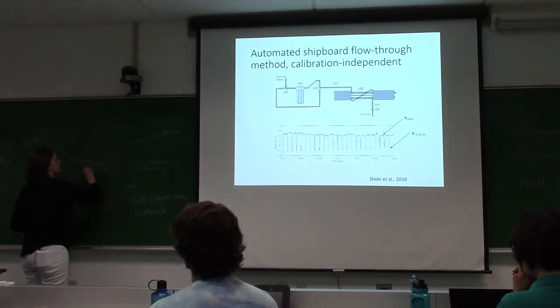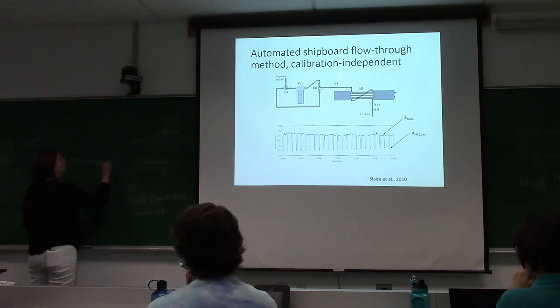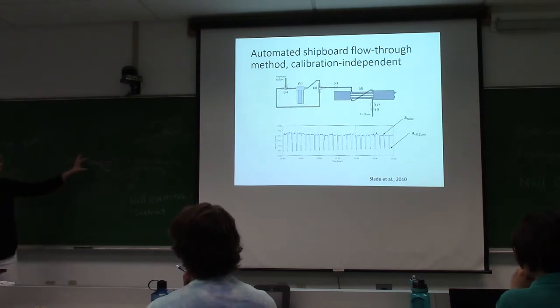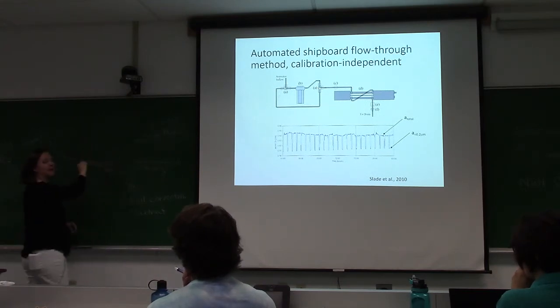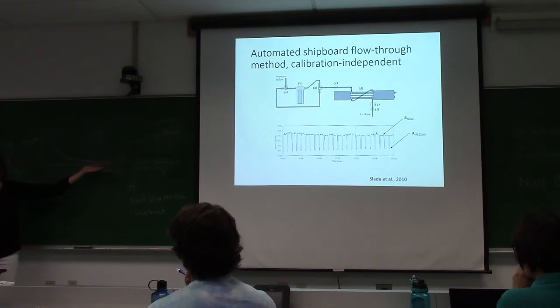What do you know about this in the infrared region? What's happening in the infrared? Why is your measured value much lower? We haven't done any corrections yet. Temperature, right? The temperature and salinity shows up here. So what if you didn't have a CTD with you to do your temperature correction? You can actually use that as an estimate of temperature. So you can do the back calculation and calculate temperature from your dissolved absorption reading, which means that you just got 2 instruments for the price of 1.